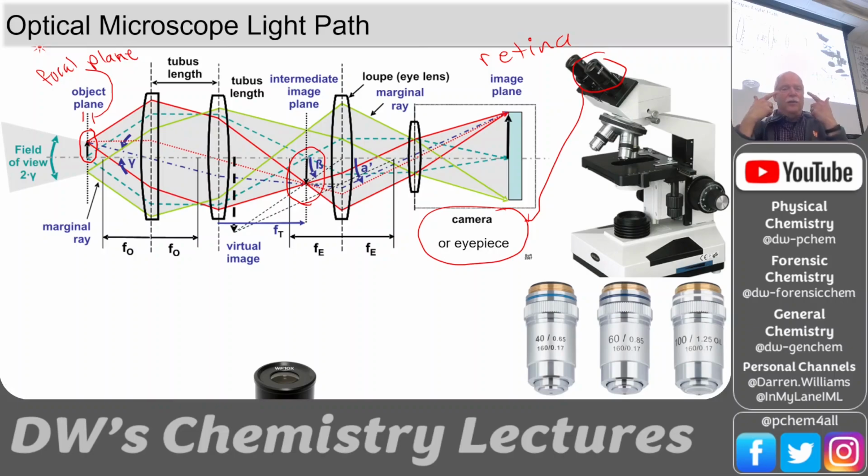And so that's going through your cornea. Some of these microscopes, almost all of them, will have some adjustment on one of the eyepieces. The procedure is to close one eye and get it in focus with the eyepiece that's not adjustable, and then you open the other eye. Let's say it's the one on the right that's adjustable. You keep this one centered. You close this eye, you get it in focus, and then you open this eye.